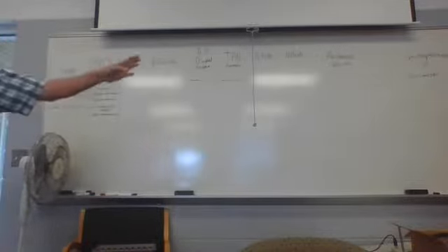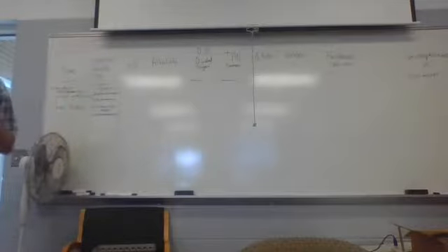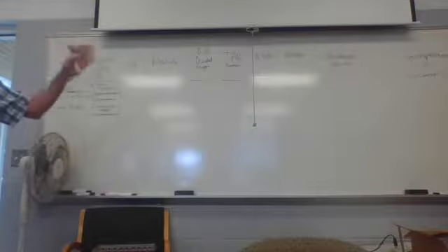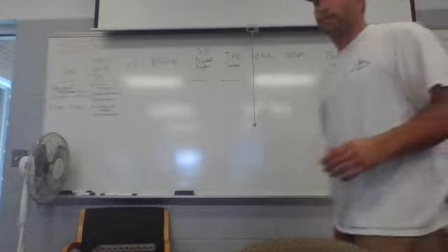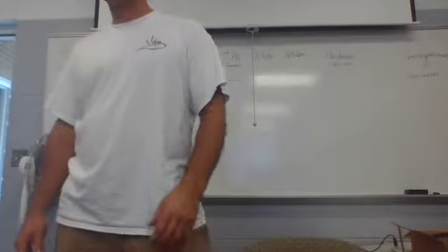And the way I see a colorimeter is really, it's something that basically reads very precisely that color change for you. And the color that you're seeing really is just about which wavelengths of light are being absorbed versus transmitted or reflected back out of there. So I think it's just a fancy way of more precisely reading colors for some of these tests. Of course, maybe I'm wrong about that. I just don't know what's different about a spectrophotometer, but it's doing something similar, same principle.